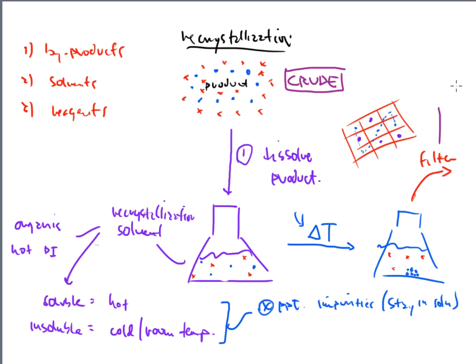And then here in the very end, we are talking about our recrystallized version of that product, which should be a purer product, which should give me physical property tests that are much closer to textbook values. So boiling points, melting points, refractive indexes, densities, all of those should go much closer with a recrystallized product versus a crude product in the very beginning.